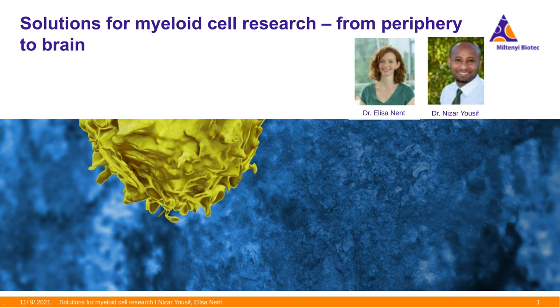Some researchers have long experience with positive isolation and prefer to stay with it, and others are used to the untouched isolation methods. Moreover, there is good literature available, where researchers are using our different monocyte isolation methods to isolate monocytes and differentiate them into macrophages. You can have a look at it in PubMed. Great, thank you. Next question.